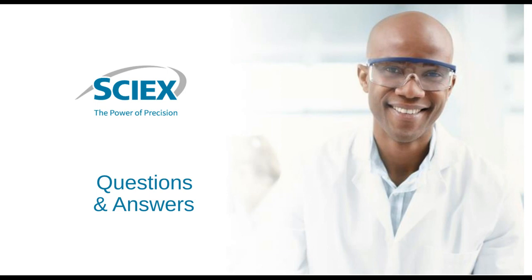Thank you so much. And we have time for a few more questions. Is there a specific ratio for the concentration of the dye to the concentration of target protein?